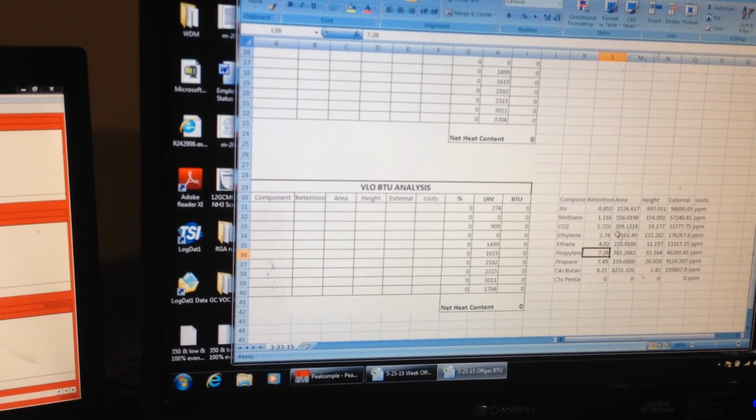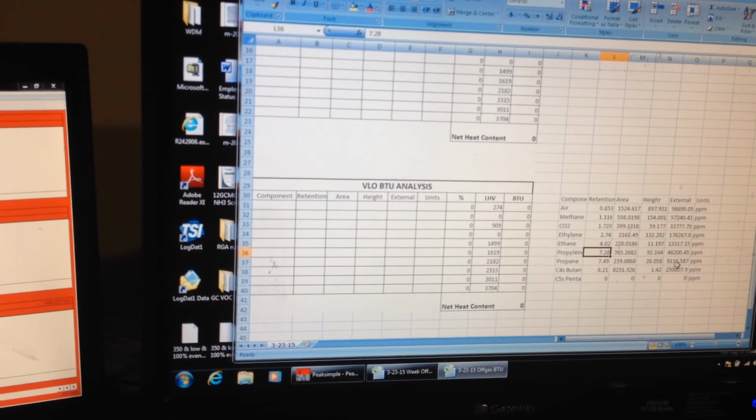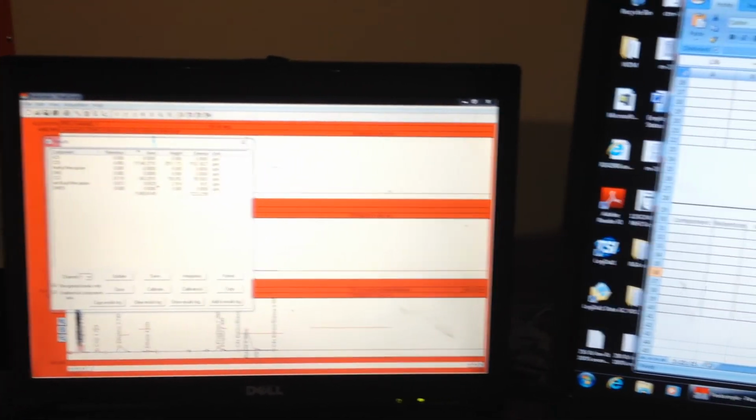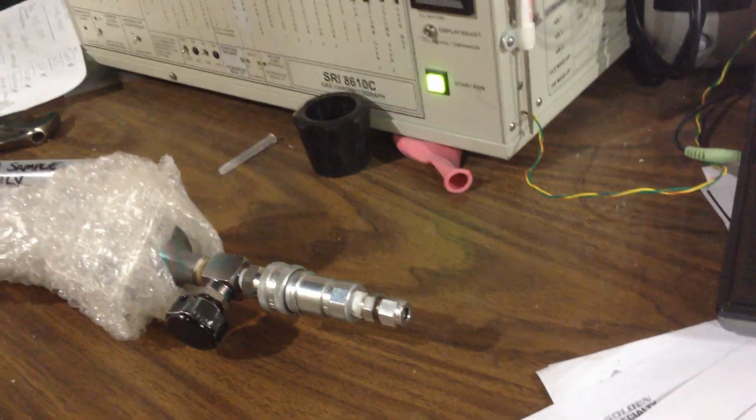Same thing here. This isn't our full, but we'll be able to reference these that we do have with the next run just to make sure that we have some consistency. I'll go ahead and run the next run now for 20 minutes, by injecting the same method we did here just a minute ago, and we'll see what we get on our run 2.